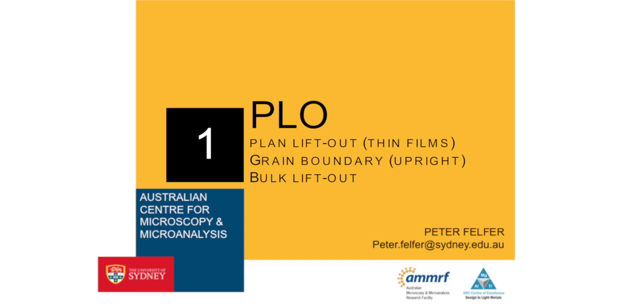So the first and the most simple one that I'm gonna give you a rundown on is the plan lift out, or what we call plan lift out. Just imagine if you've got a thin film on a substrate, your thin film would be sitting flat on your support structure. If you've got a grain boundary, the grain boundary would be sitting upright in your lift out piece.